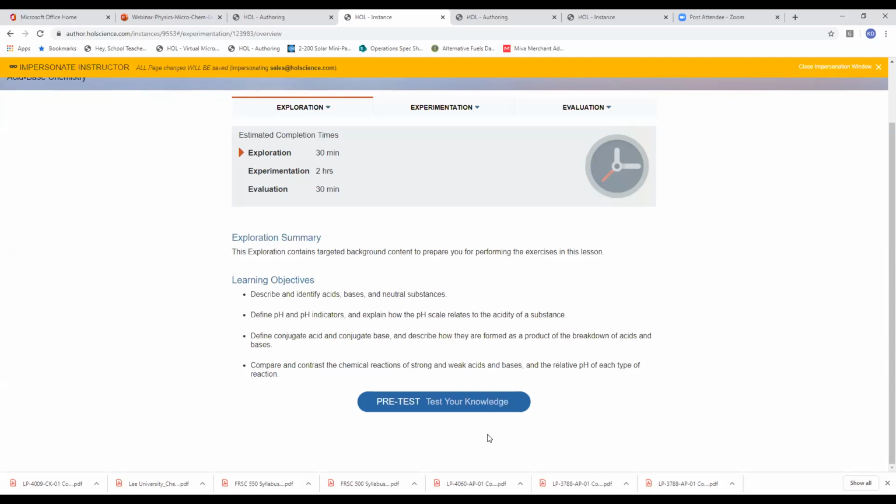And this specifically is a formative assessment. It's designed to determine how much knowledge the student has coming in to this particular lab. So, you know, has this information been covered in the lecture? How well grounded is the student?